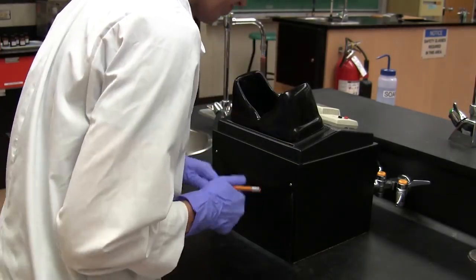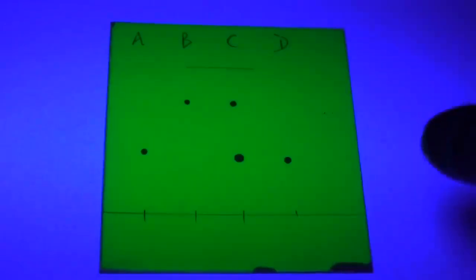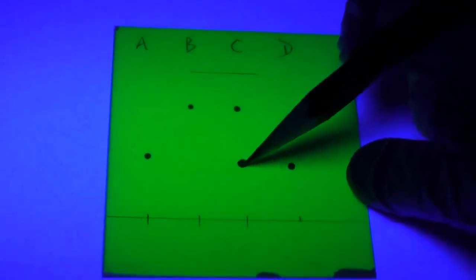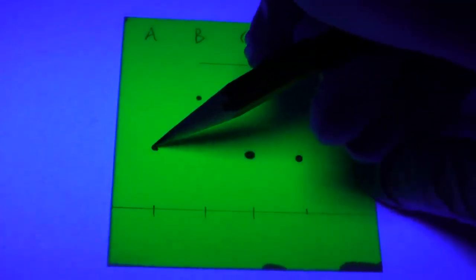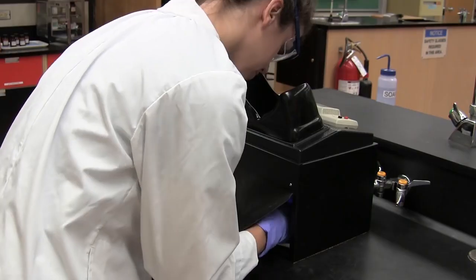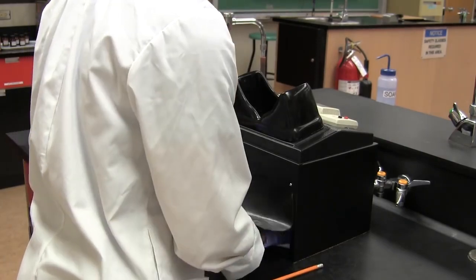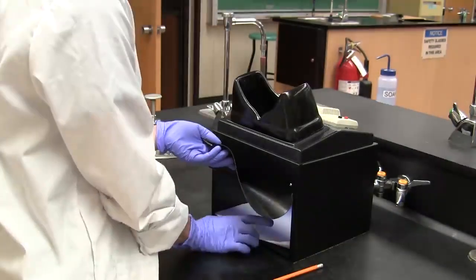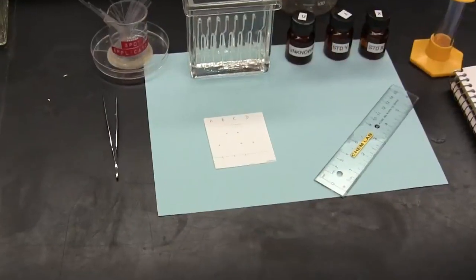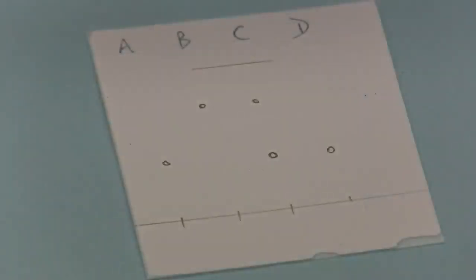So while visualizing the plate under UV, we are now able to outline all the spots with a pencil so that we can locate the spots under visible light. And once all the spots are outlined, we can remove the plate from the UV light box. And now that the plate is no longer under UV light, we can see all the spots together with the solvent front. Let's take a closer look at the results.